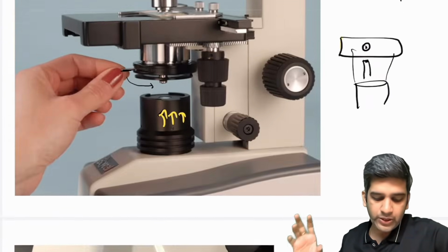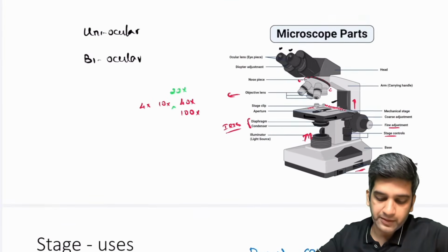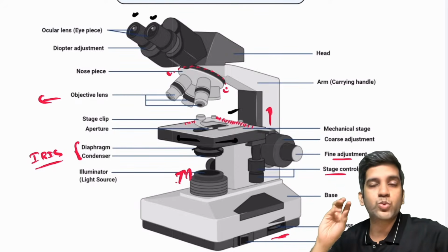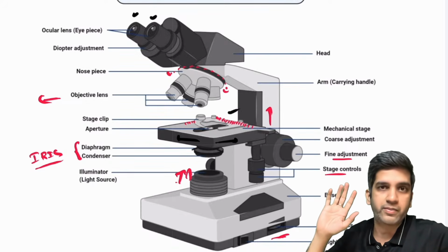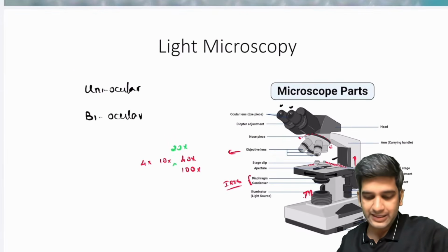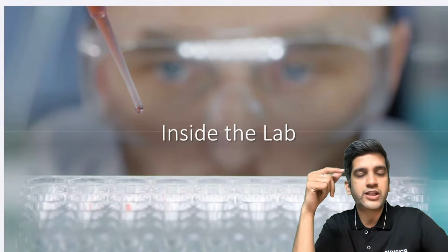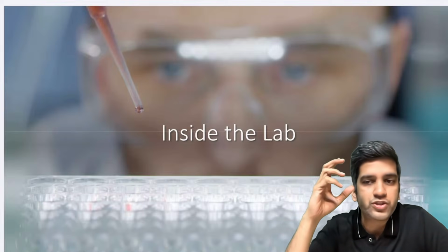We saw about the individual different parts of a microscope, what's the function, and this is a labeling of the microscope. Once in an AIIMS exam, they just asked a few options A, B, C, D, put a question mark for the condenser and asked what is the question-marked part of the microscope. Might even come. Sometimes basic questions do come. Unfortunately, we stumble there. Fine. Okay, that's about the first series of inside the lab about the simple normal microscope, right? In the subsequent series, I'll go with fluorescent microscope, electron microscope, few stains, few procedures, and lots more. Fine.